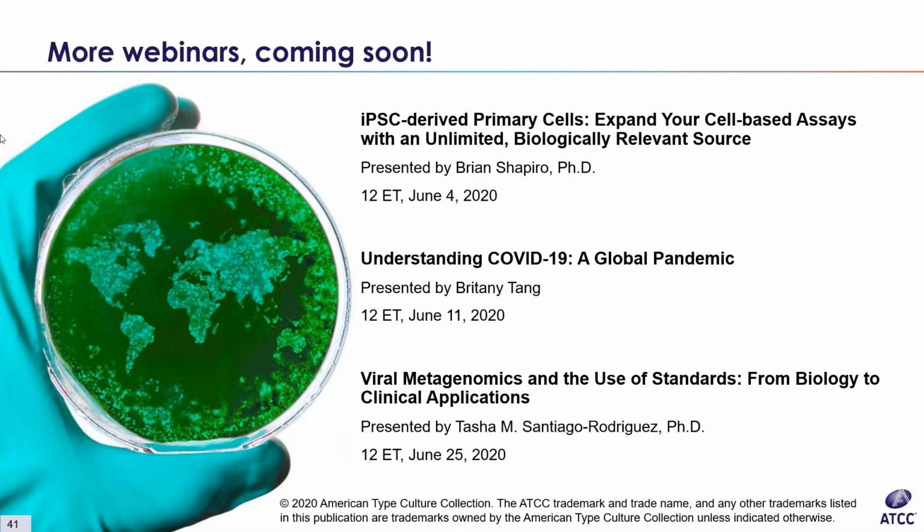Between 50,000 and 100,000 cells, you can't really tell the difference, but you can tell the difference between 5,000 and 10,000 cells. The XTT is more sensitive and you can detect lower cell numbers, so you have a more precise range. So it's two things: it's quicker and it's more accurate at lower cell levels.